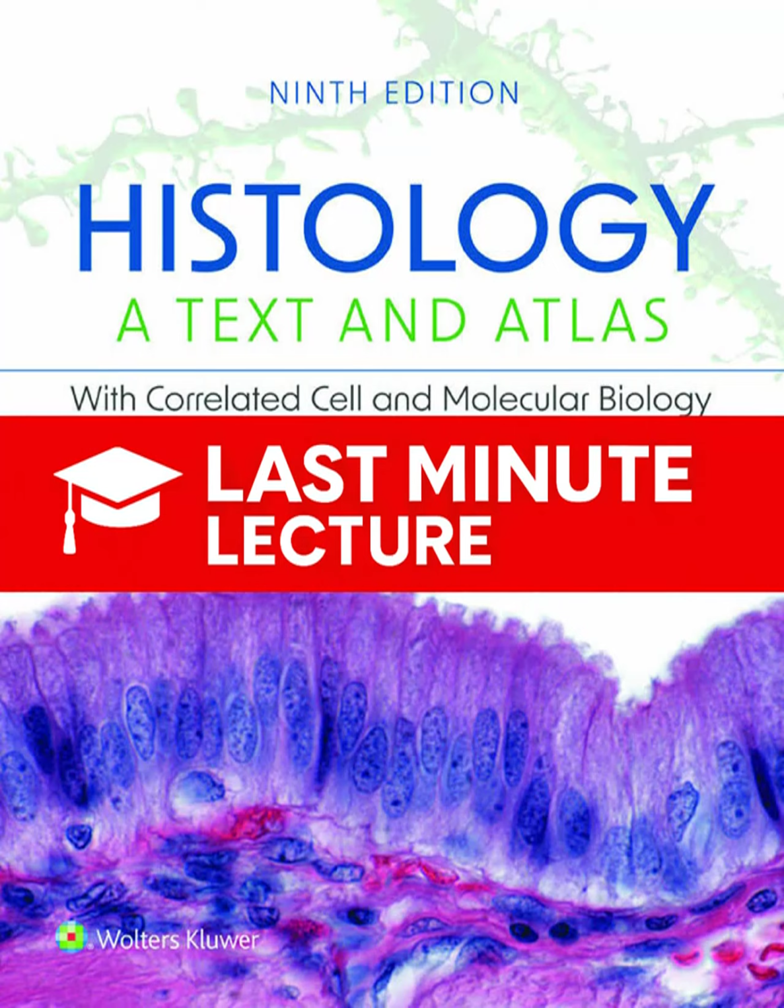This process repeats thousands of times, generating these massive, perfectly aligned stacks of images automatically. Figure 1.1 shows the final critical step in this, image segmentation. Right. Segmentation is the post-processing step, where you assign a label to every pixel associated with a specific structure you're interested in. In the figure, the nucleus is segmented and colored blue, the plasma membrane green. This lets researchers isolate and model those structures in 3D. It can be a tedious manual process, but it's essential for making sense of the data.